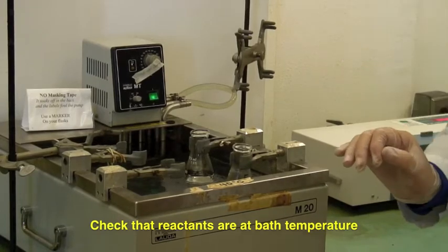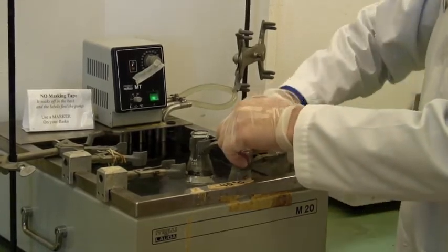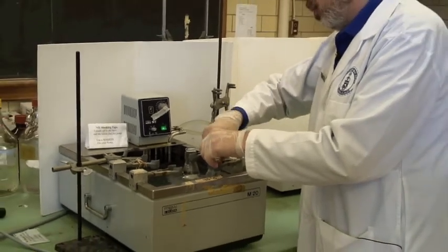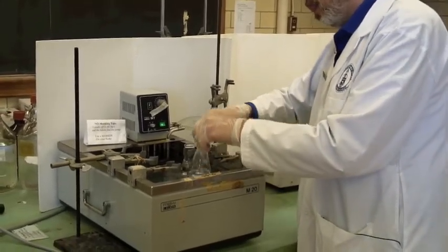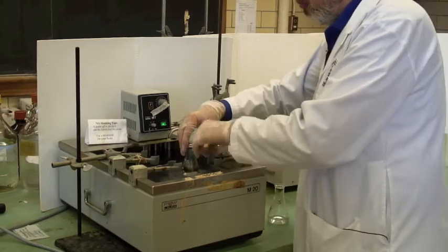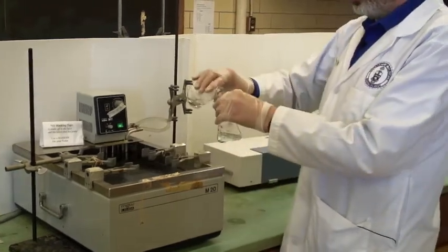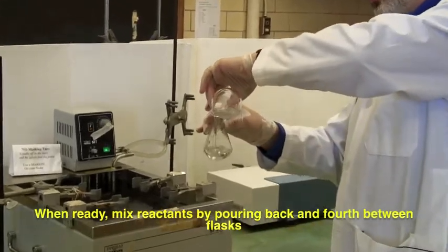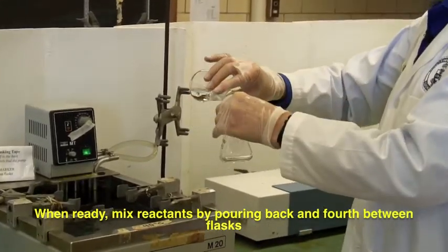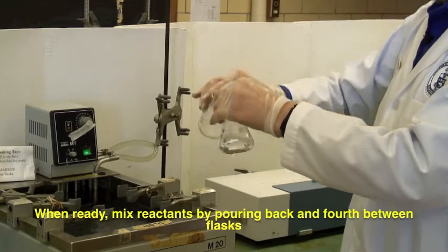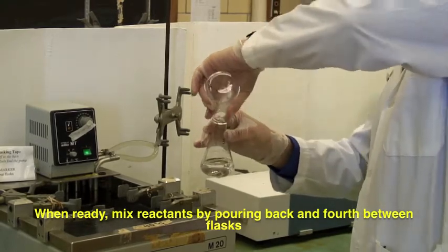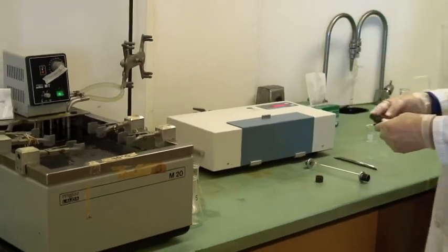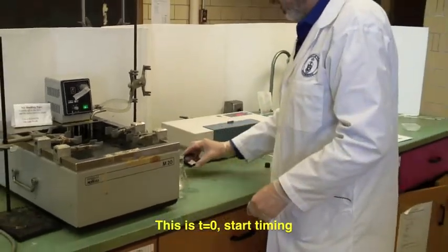So we're now ready to start the reaction. And we do this by opening the clamps to get the flasks out. And then when you're ready, pour one into the other. And you pour them back and forth between the flasks three or four times to get complete mixing. Take your stopwatch and start the reaction timing.